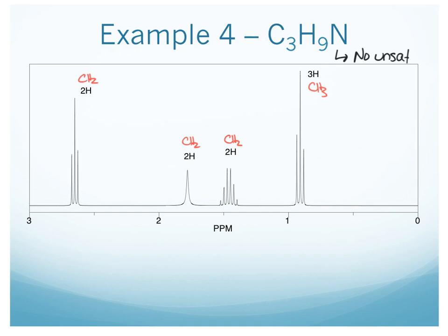Well, nitrogen, like oxygen, typically you don't see splitting through that peak. So this broad singlet here, that is most likely your nitrogen group. So instead of CH2, let's make that an NH2. Okay, now as far as connecting things together, let's take a look at the splitting here.